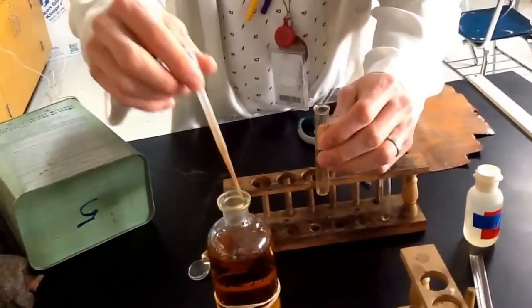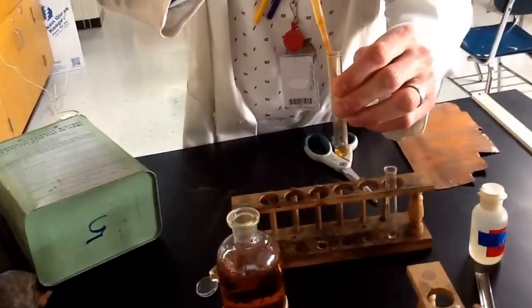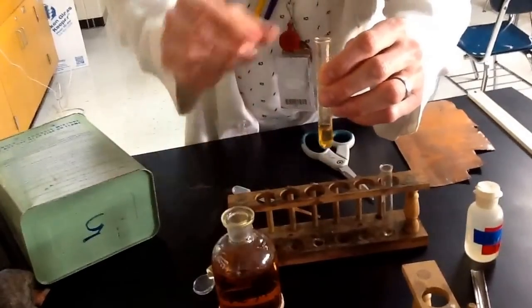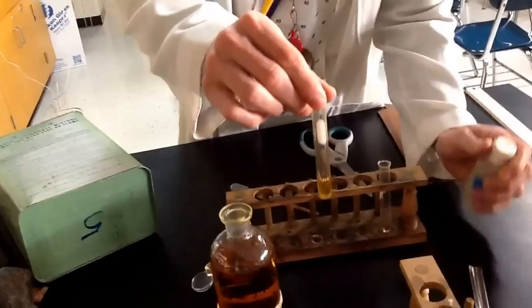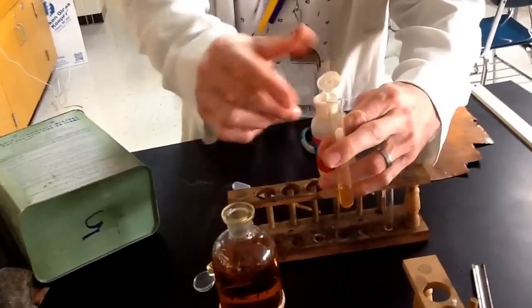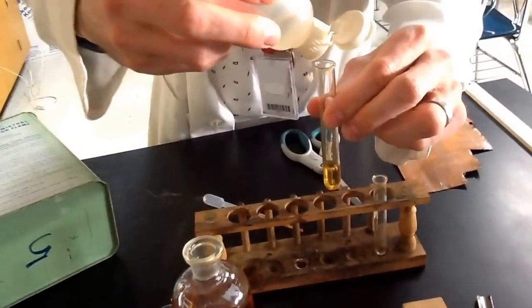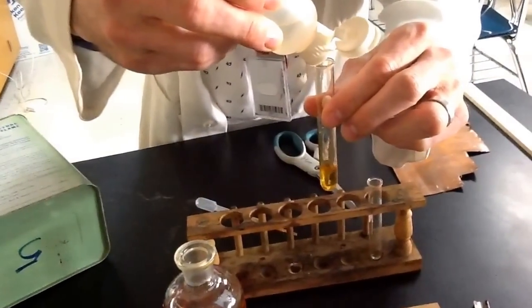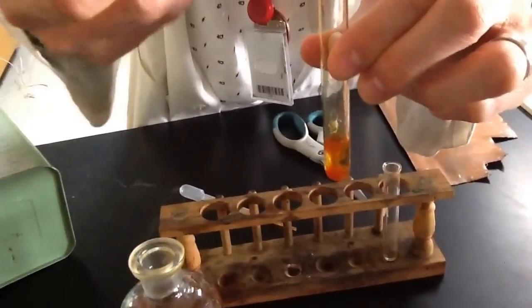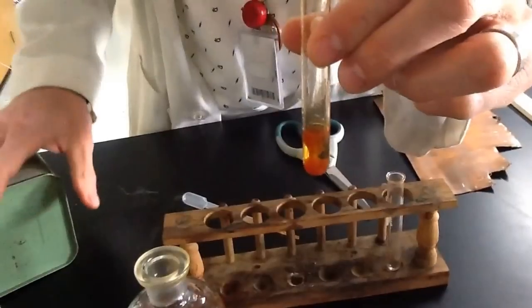So I'm going to go ahead and grab some of the iron nitrate and put it into the test tube. You'll notice the color is now a little bit lighter just because there's not as much in that test tube. And I'm going to take some drops of the sodium hydroxide. And when they switch partners, you might notice what happens here. You see that, guys? That is a solid, also known as a precipitate, that's forming.